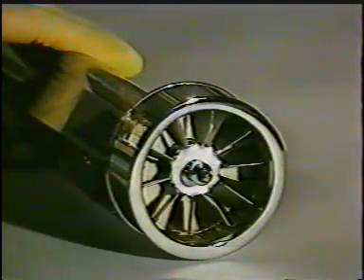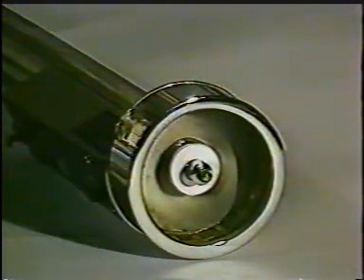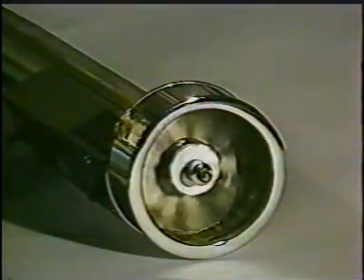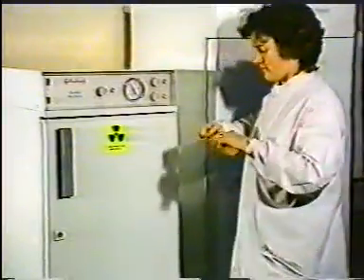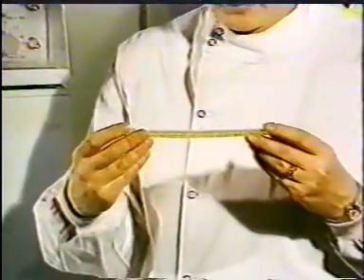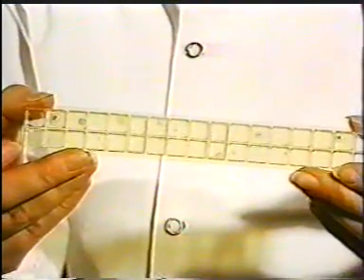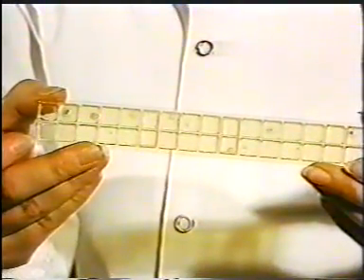Levels of microbial contamination are also monitored with a suitable air sampler, which draws in a known volume of air and causes any microorganisms present to impinge onto an agar strip. The strip is then incubated and examined for colonies. This method has the advantage that some indication is obtained of the actual number of airborne microorganisms in a given volume of air. The contamination of surfaces may also be checked by using contact slides.